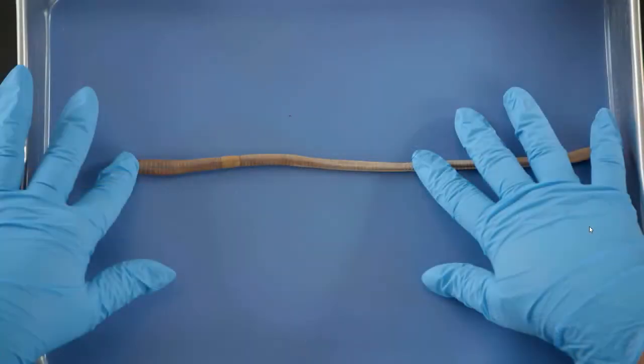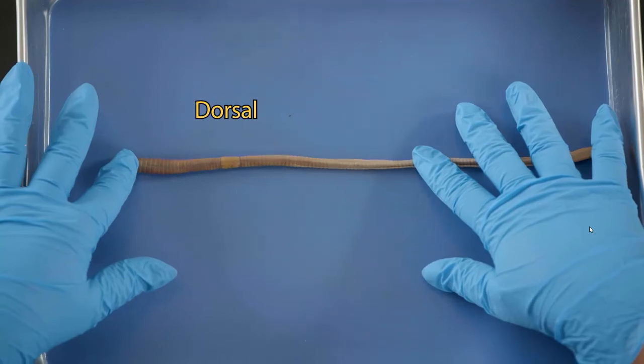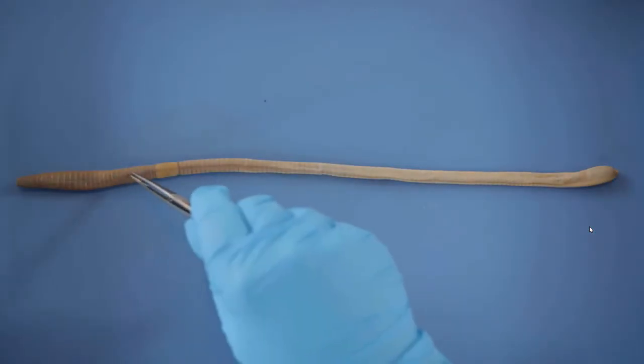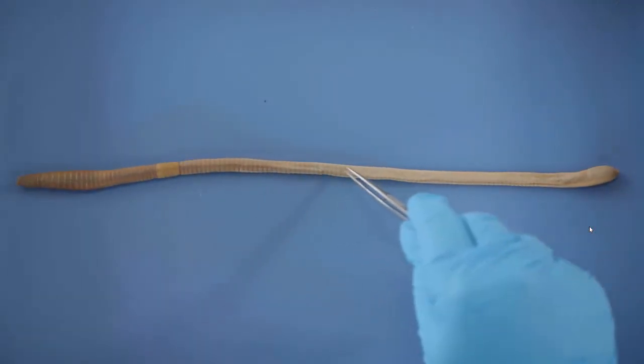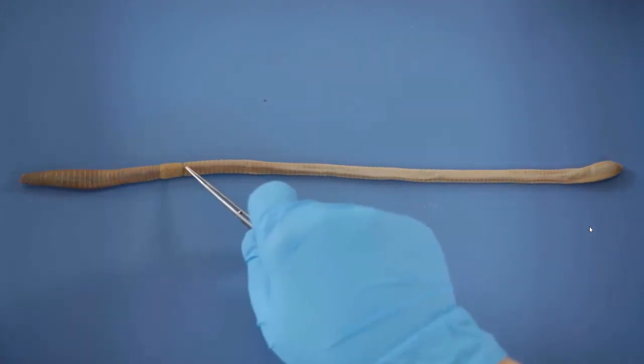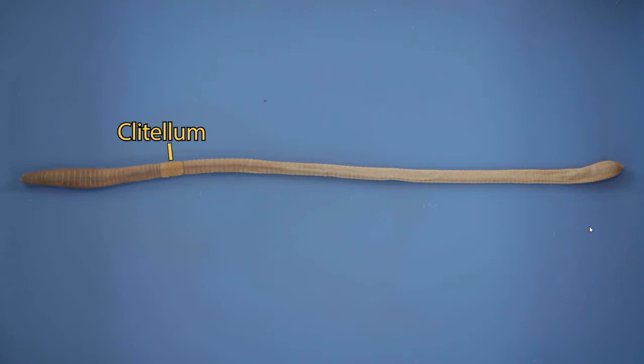Also notice that the dorsal, or top, surface of the earthworm is slightly darker than the ventral surface of the earthworm. Now, notice the segments on the earthworm. The earthworm's body is made up of over 100 segments. The enlarged structure beginning at segment 31 is the clitellum. This structure is vital to external fertilization in earthworms.